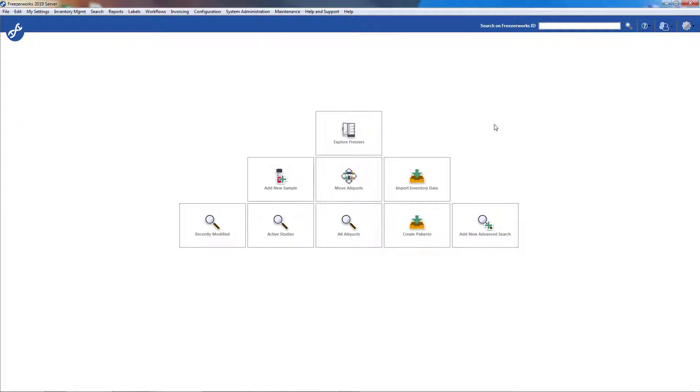Hey guys, welcome to the Freezerworks 2019 learning series, your visual guide to our sample management software.